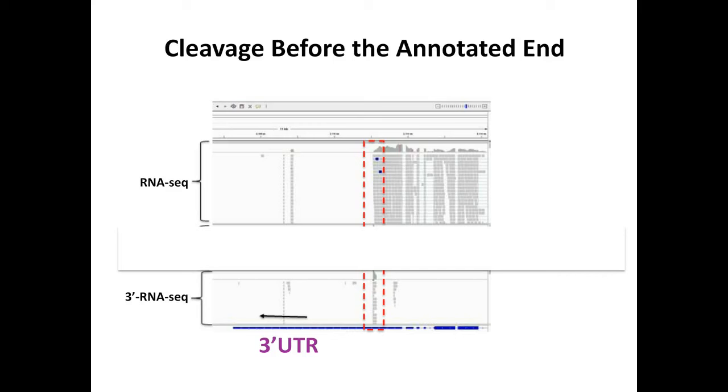So obviously this gene model would also be wrong. It needs to be shortened. It is the opposite of what we just talked about. This gene in the database is longer than it's supposed to be. We also fixed this problem by finding out where the end of the transcript is and cutting it, reducing it to the smaller transcript. So this is another problem.